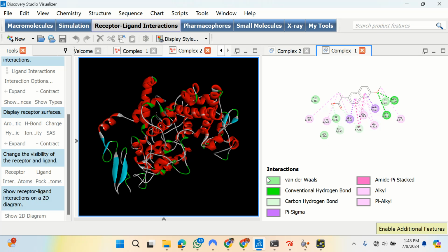So what I do is look for a ligand that comprises most or all the kinds of bonds in that interaction, so that after pasting in my work, I'll only post these pictures, leaving this. Then at the end, I'll just carry one of these and put it on it. Try to have everything. That is just what I'm trying to say. If you keep pasting this together, it will occupy space. Are you getting that? So that is what I wanted to show you here.